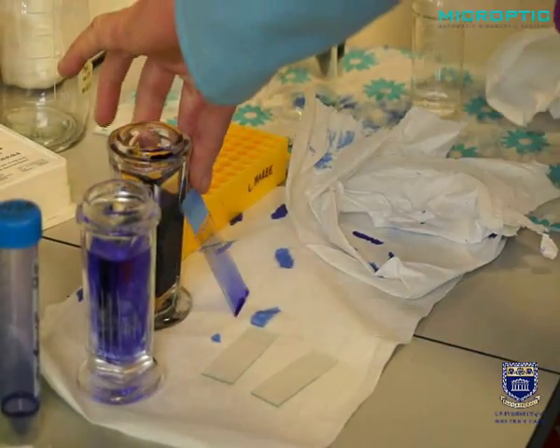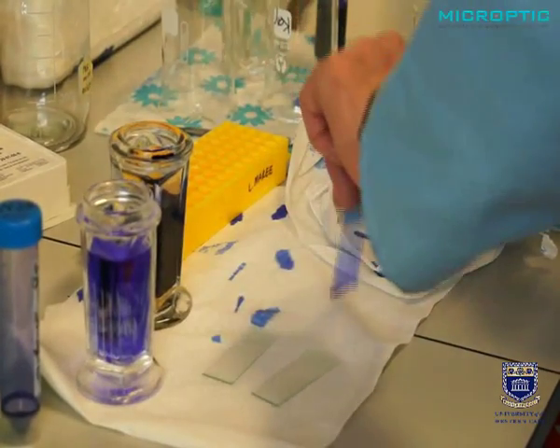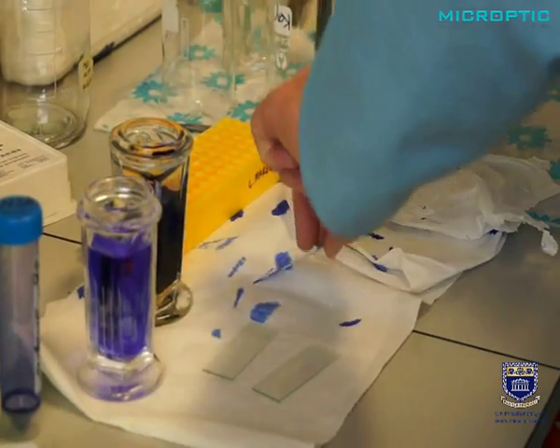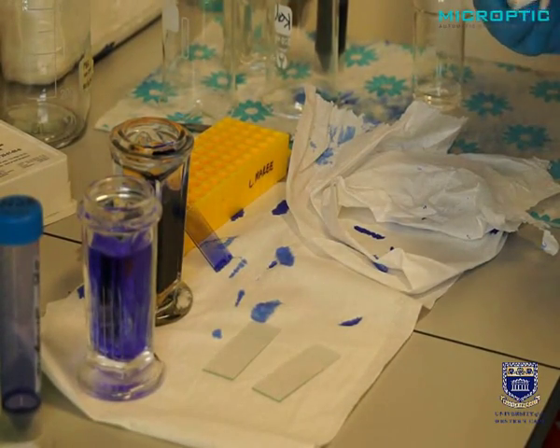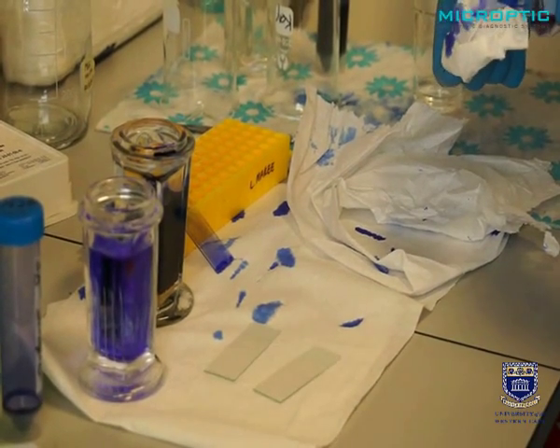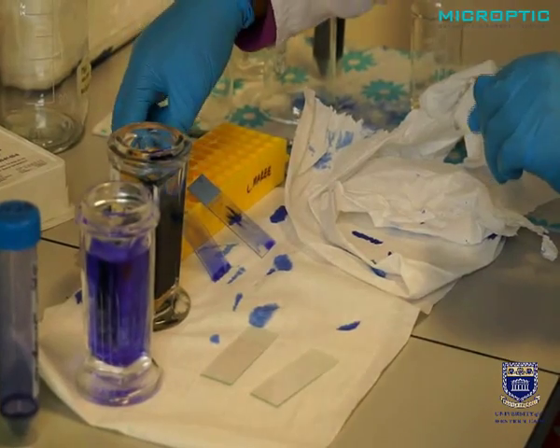And you can lean it against there, and that is fine. We can normally just take off most of the stain also at the tip, and also clean the back of the slide. This is really important. Lots of people do not take care to clean the back of the slide.